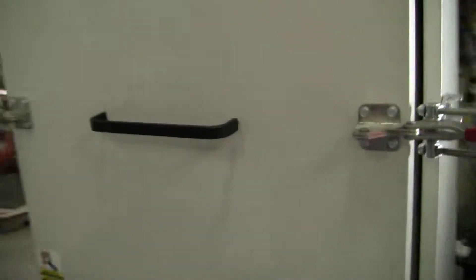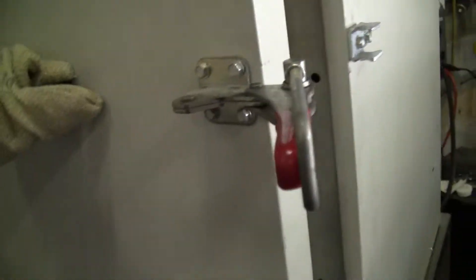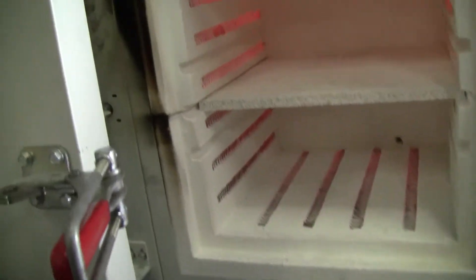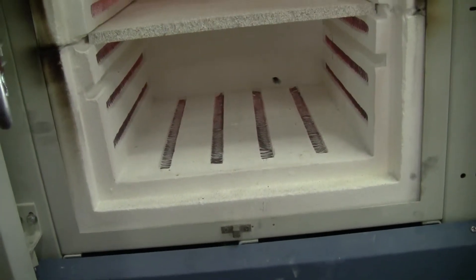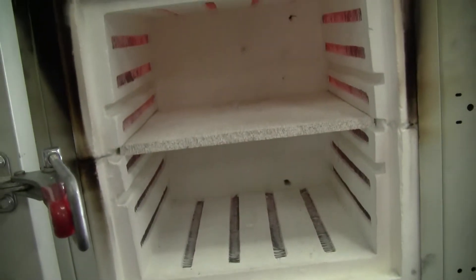Let's take a look at the other side. Let's open it up a little bit. You can see a nice red glow. It's cooling down — just opening the door dropped it considerably, letting all that heat out.